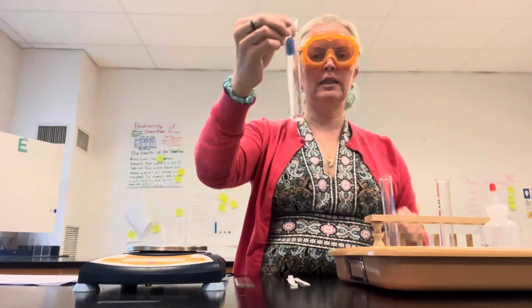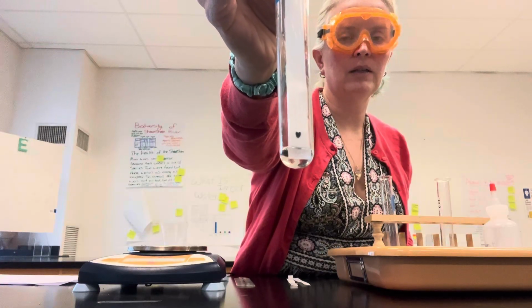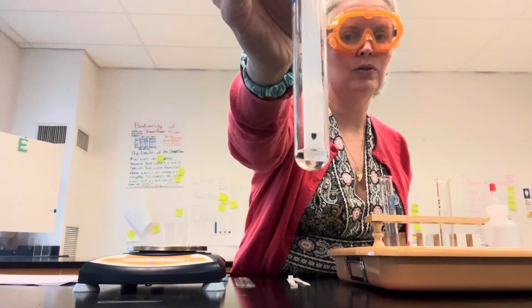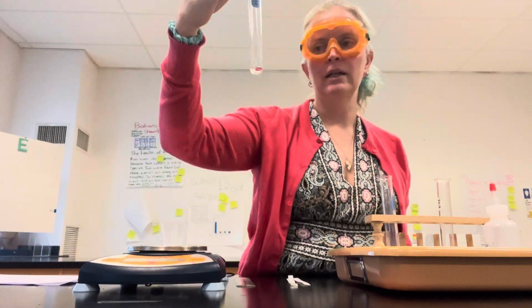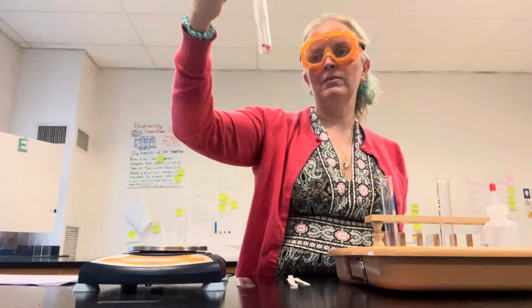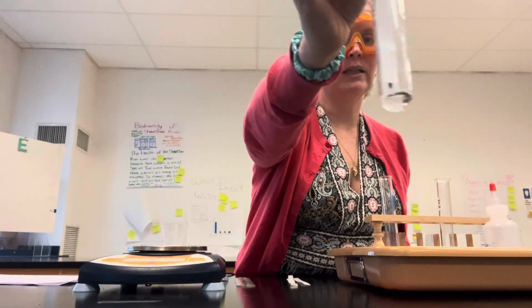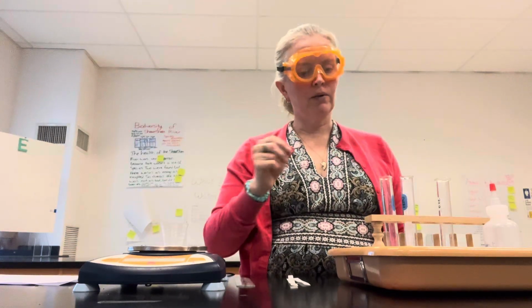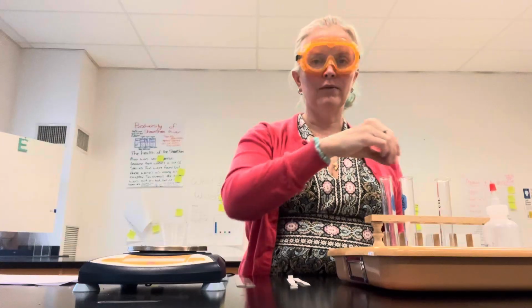So we're starting to see it separate. Look there. Meaning that the ink blob is getting bigger. And if we wait a little bit longer, you should start to see that there's more than one color appearing there. Some pens can have similar colors that are used in making the ink, but we'll try to give you pens that will give you different results. That way, when you are writing your conclusion, you can say that you are confident in your result.